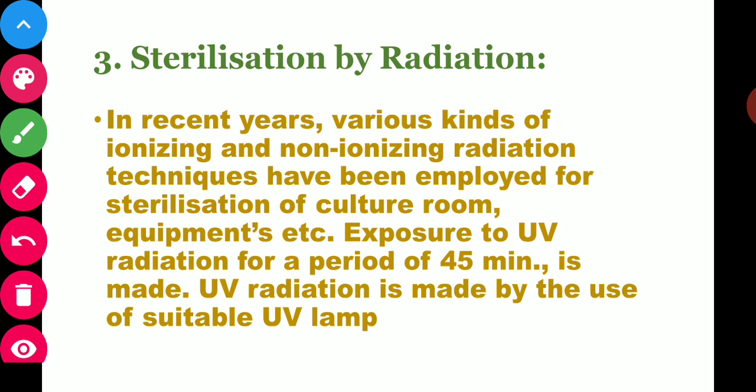Sterilization by radiations. In recent years various kinds of ionizing and non-ionizing radiations are also employed for sterilization of culture room equipment. Exposure to UV radiation for a period of 45 minutes is made. UV radiation is produced by use of a suitable UV lamp.